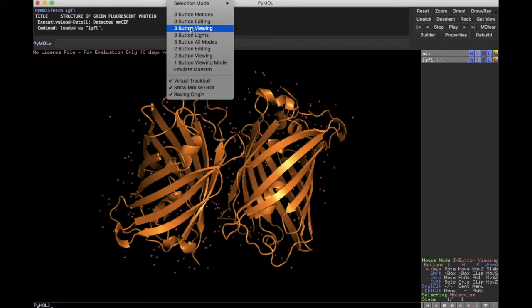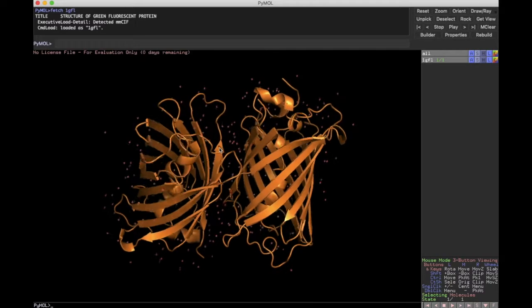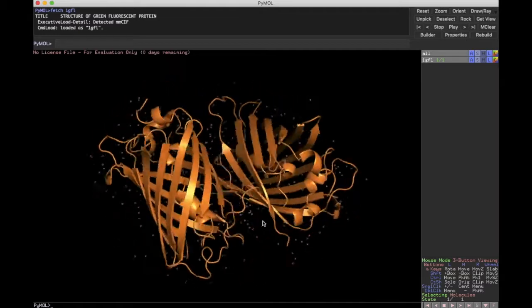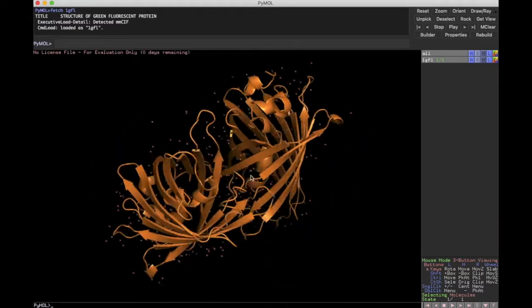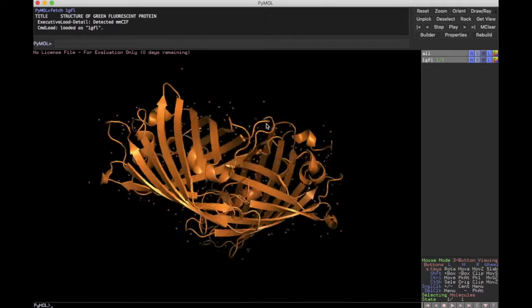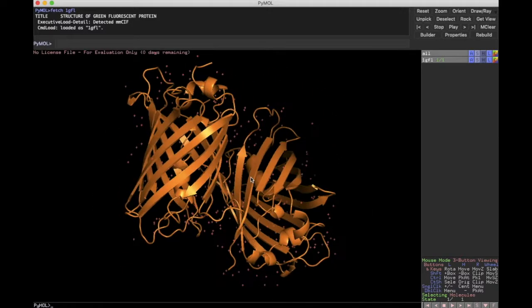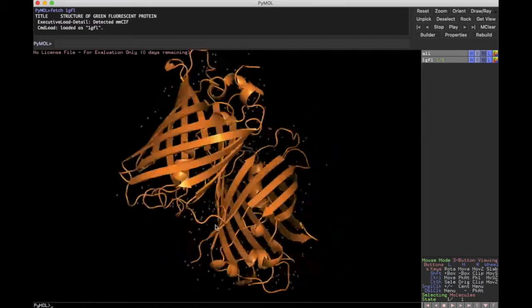So you'll see some of what I'm doing here, and you'll just have to click around and learn the system based on what your computing layout is, okay? So I'm not going to click on anything. I'm just used to opening it and clicking around with stuff, okay? So for me, if I just click on my trackpad, which would be the equivalent of, I guess, a left click, and then I'm just moving another finger around the trackpad, I can rotate the molecules around in 3D, okay? So that's a pretty simple manipulation. So you might just need to left click and move your mouse around, and it might just swirl them around, okay?